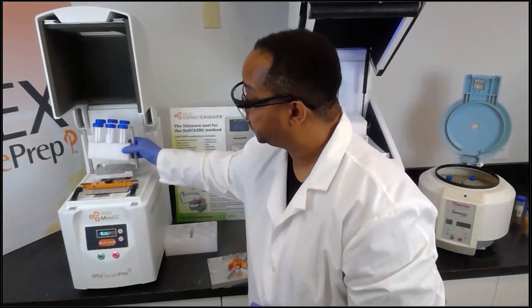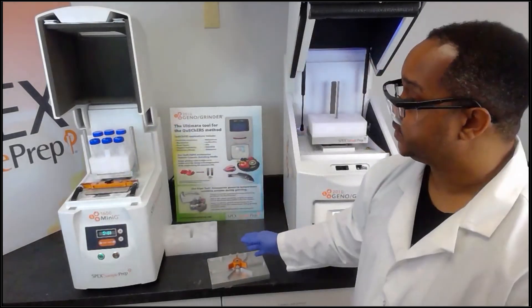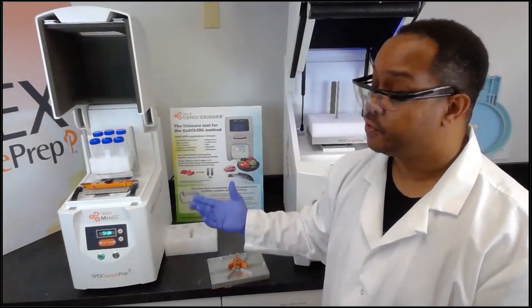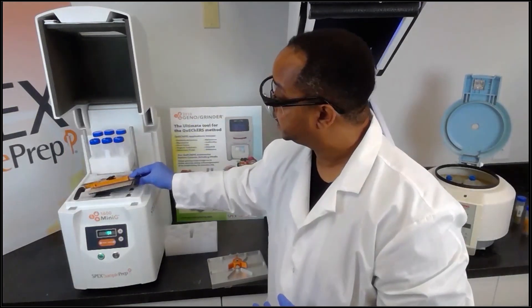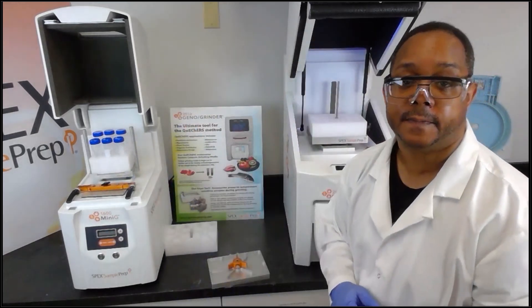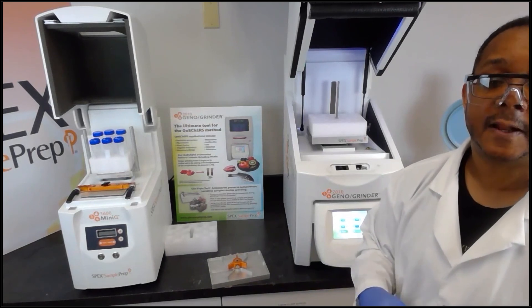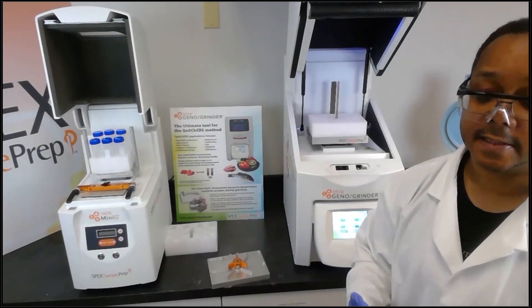You can easily prepare your samples using foam holders that are available for both the Mini-G and the GenoGrinder. The Mini-G can also run different types of samples — titer plates, 2 milliliter vials, jars of different sizes — as the adjustable clamp can easily accommodate different sizes. This concludes the brief demonstration of the QuEChERS method, showing how things can be completed in three simple steps: the agitation step, the cleanup step, and the final analysis step.